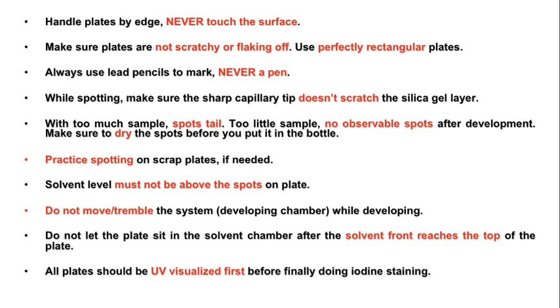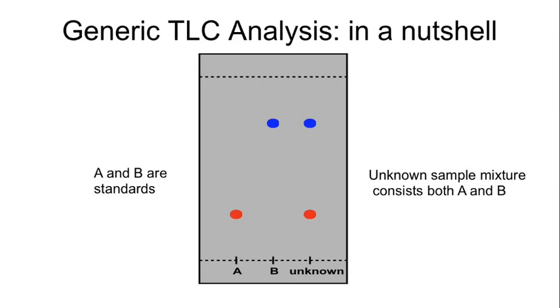And before we send you off with those final words, I do want to do a brief mention about solvent effects. Okay, so if we took a look at a TLC plate and we said that we had compound A, compound B. Okay. We said, okay, fine, I don't like how far those spots traveled. Okay, I want them to travel less. Okay, what could I do to get those spots to travel less?